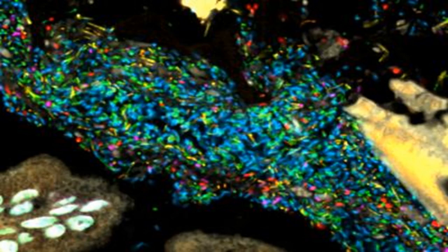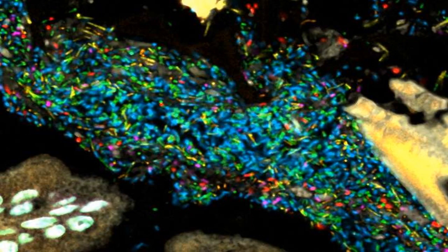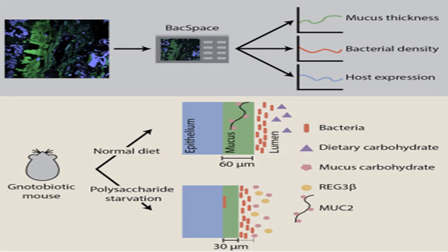Image: bacteria in a model human gut microbiome established in a germ-free mouse. Each bacterial species is lit up with a different color probe, creating a map of the community's spatial view. Credit: Jessica Mark Welch and Yuko Hasegawa, MBL, Woods Hole, Mass.